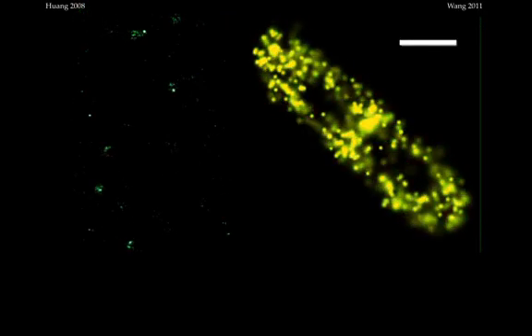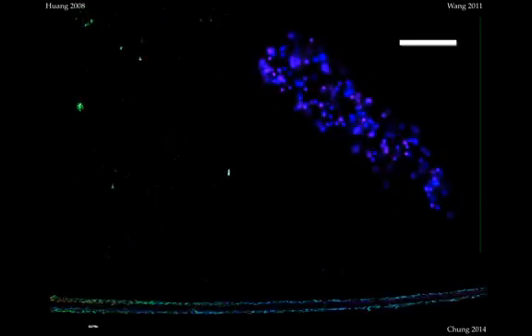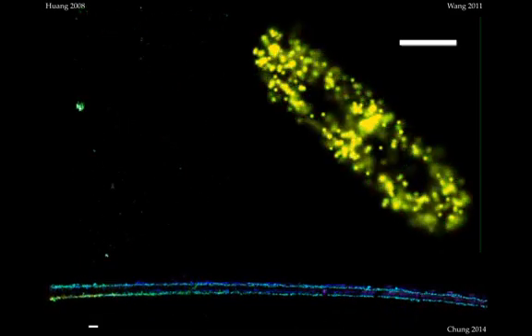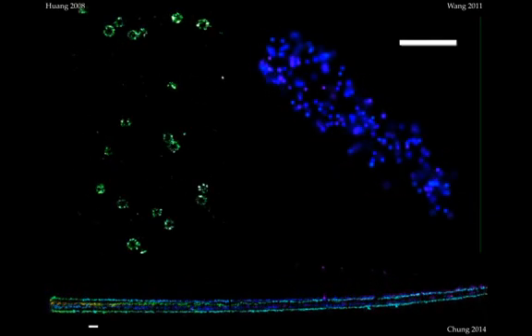Here we have the ribosomes in a dividing bacterial cell. The cellular superstructure associated with particular complexes can also be revealed. Here, staining a particular calcium channel in sperm cells shows the entire flagellar morphology.